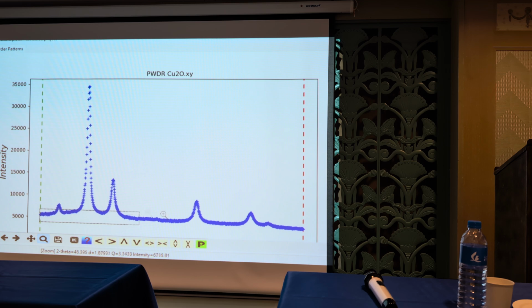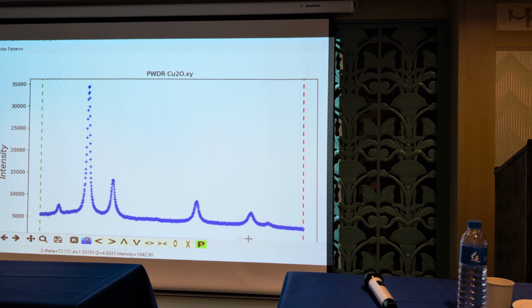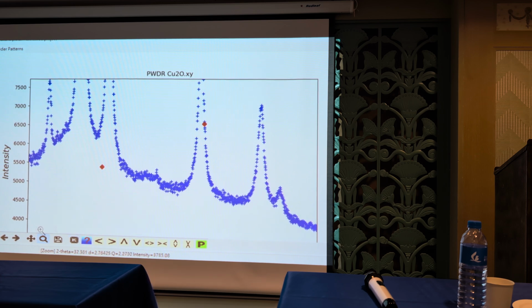First, we enlarge here. Open here. And here the program background is over here.